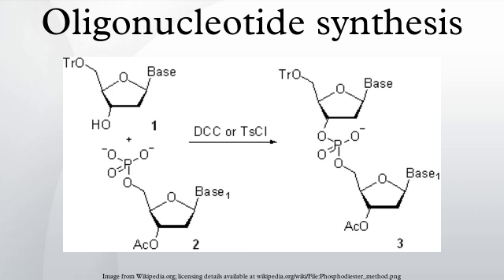The formation of these side products may be avoided by treating the solid support-bound oligonucleotides with solutions of bases in an organic solvent, for instance, with 50% triethylamine in acetonitrile or 10% diethylamine in acetonitrile. This treatment is strongly recommended for medium and large-scale preparations and is optional for syntheses on small scale where the concentration of acrylonitrile generated in the deprotection mixture is low. Regardless of whether the phosphate-protecting groups were removed first, the solid support-bound oligonucleotides are deprotected using one of the two general approaches.